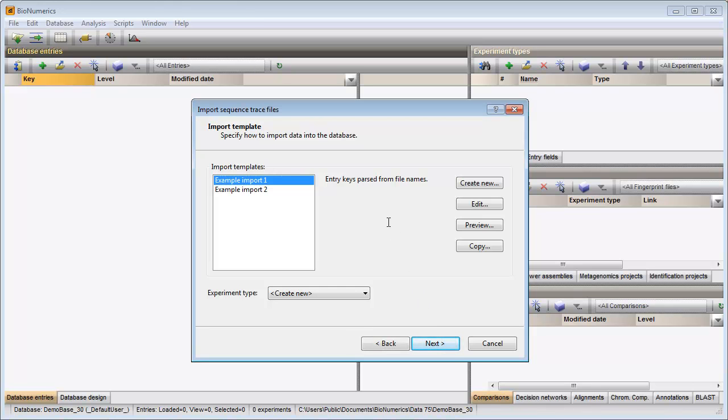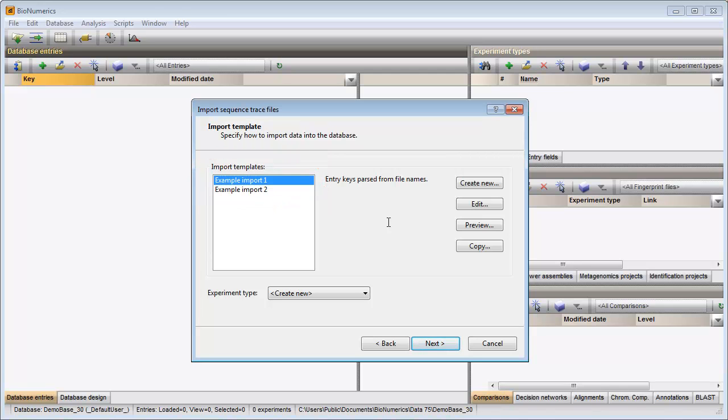The way the information should be imported in the database needs to be specified with an import template. I can select one of the default templates or create my own. As this is the first time I will import and assemble trace files in the database, I will create a new import template for my files.